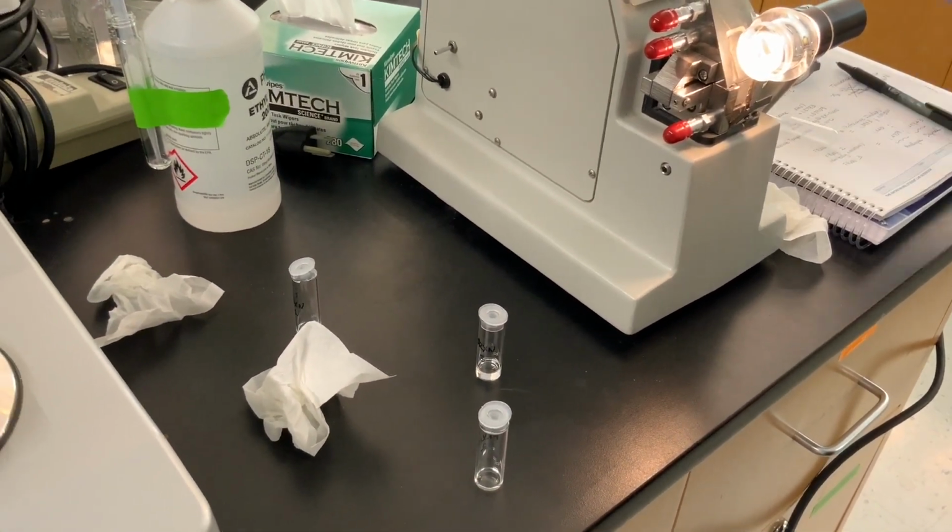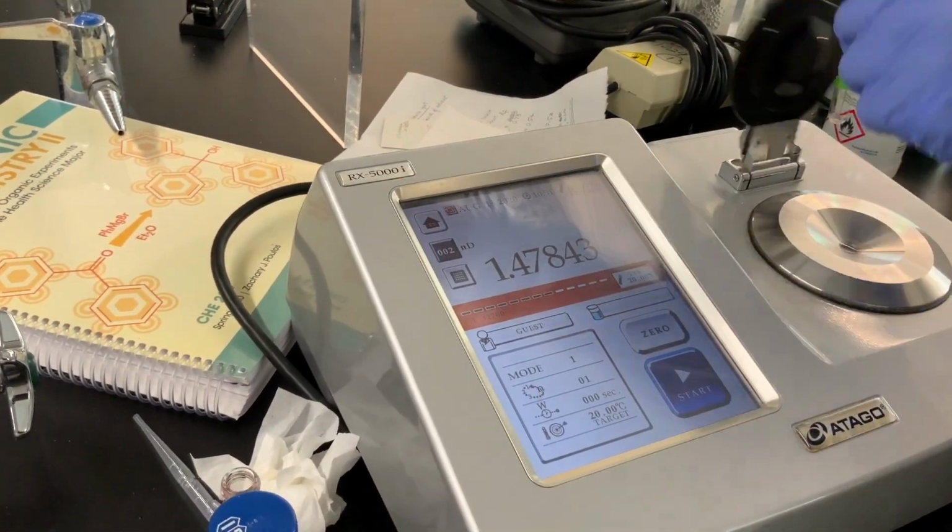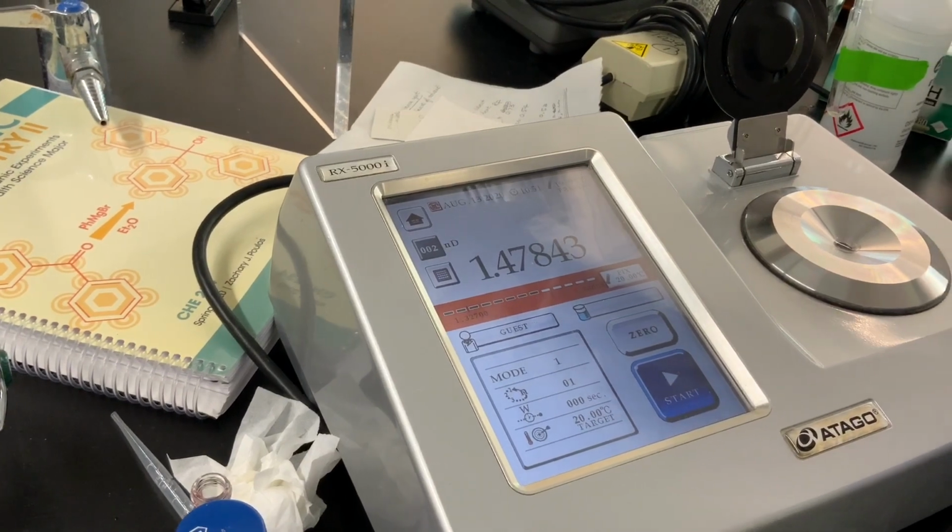And now fraction number 2 with the digital refractometer.